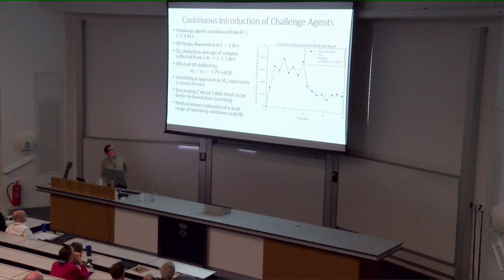Here's an illustration of data from a continuous experiment. Again, the challenge agent was introduced continuously over the entire 4-hour period of this experiment. The lamps were turned on at t equals 2 hours.